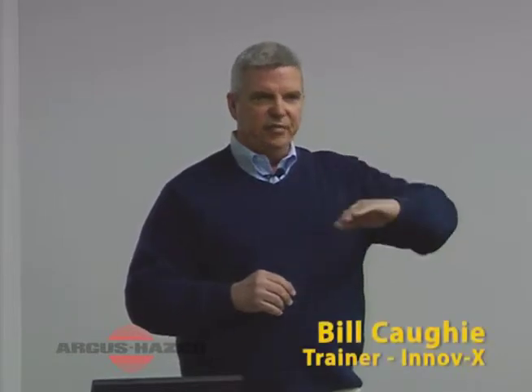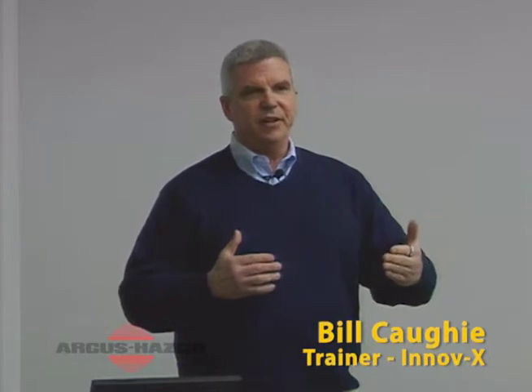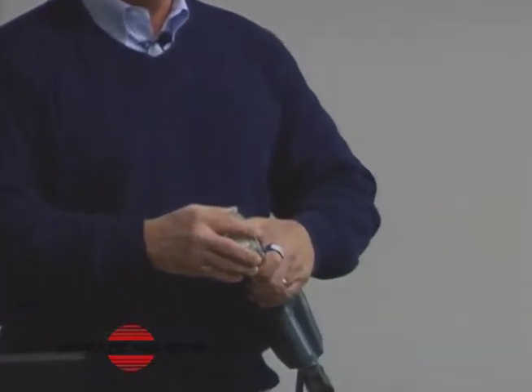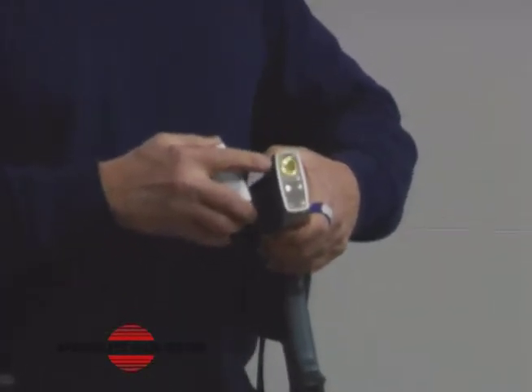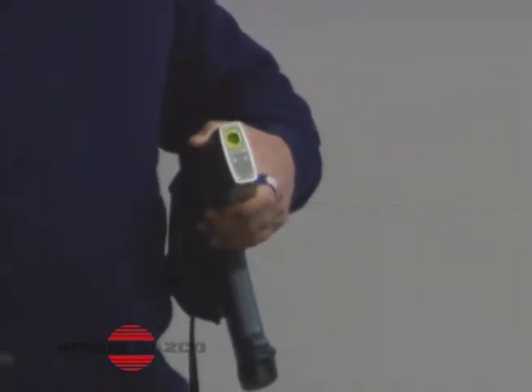As you move the distance away, the square and inverse it, that's how much the radiation is dropping. It's dropping dramatically, okay, very quickly. For instance, as I said, the tube is a 40 keV tube. By the time it gets to the window, where it's actually coming out and striking the sample, it's probably down in the 32, 33 keV range. In that little distance, it's already dropped that much. So you know that any kind of distance, it's dropping dramatically.